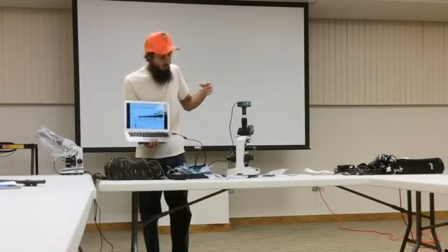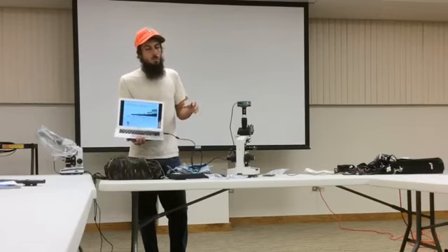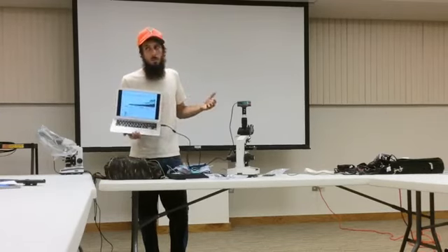And so yeah, that, and using the microscope to be able to tell you how effective an application was.